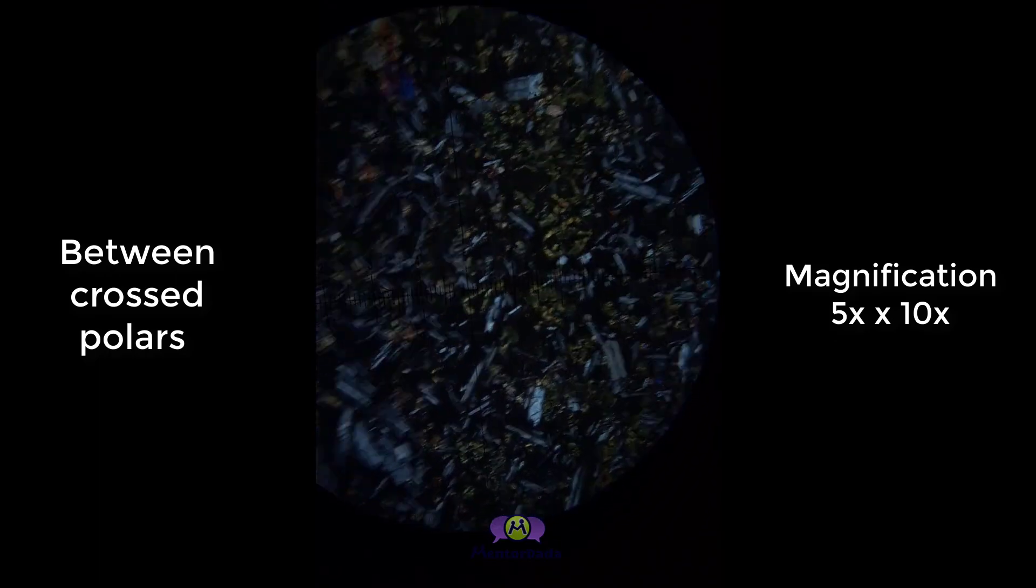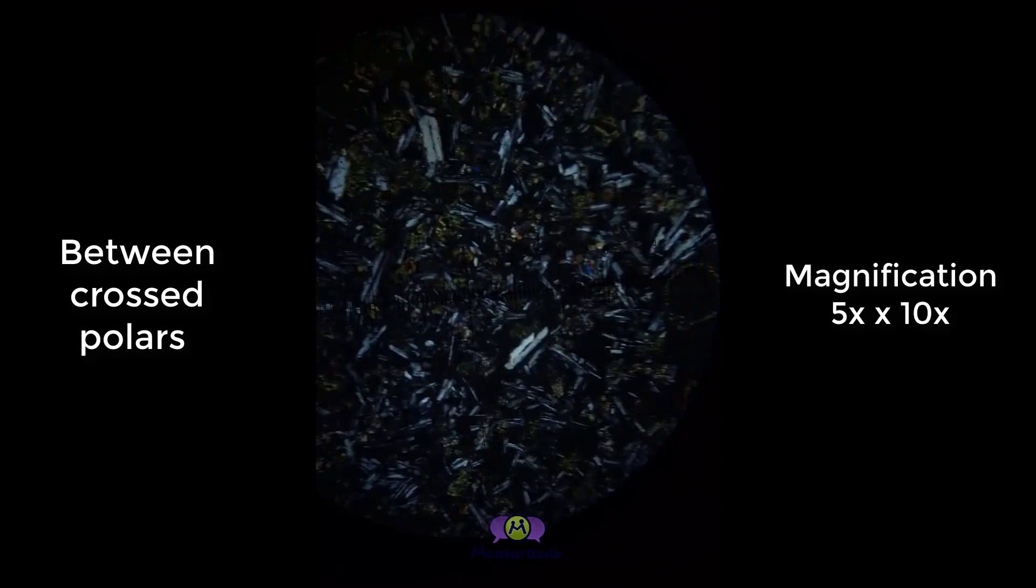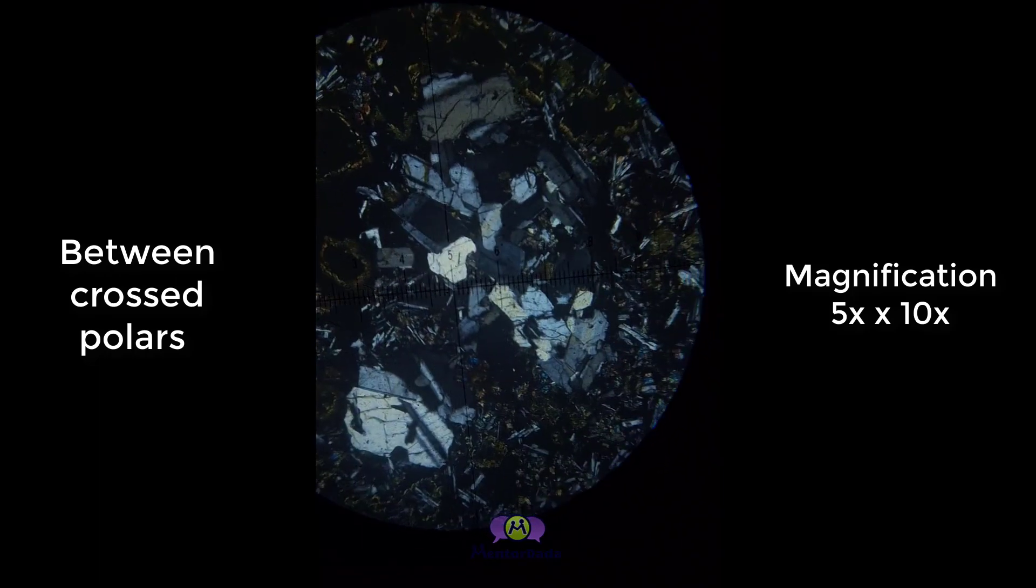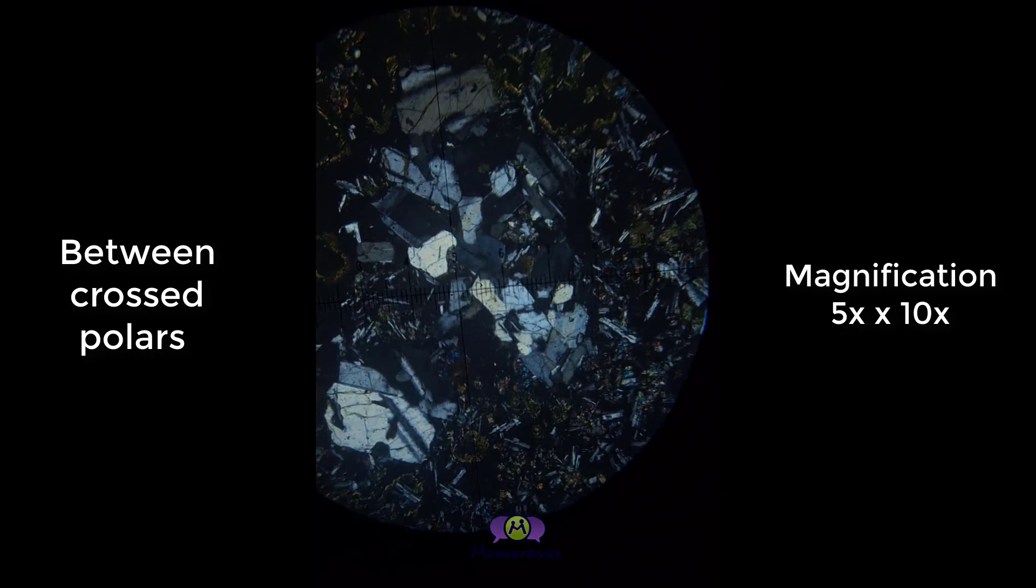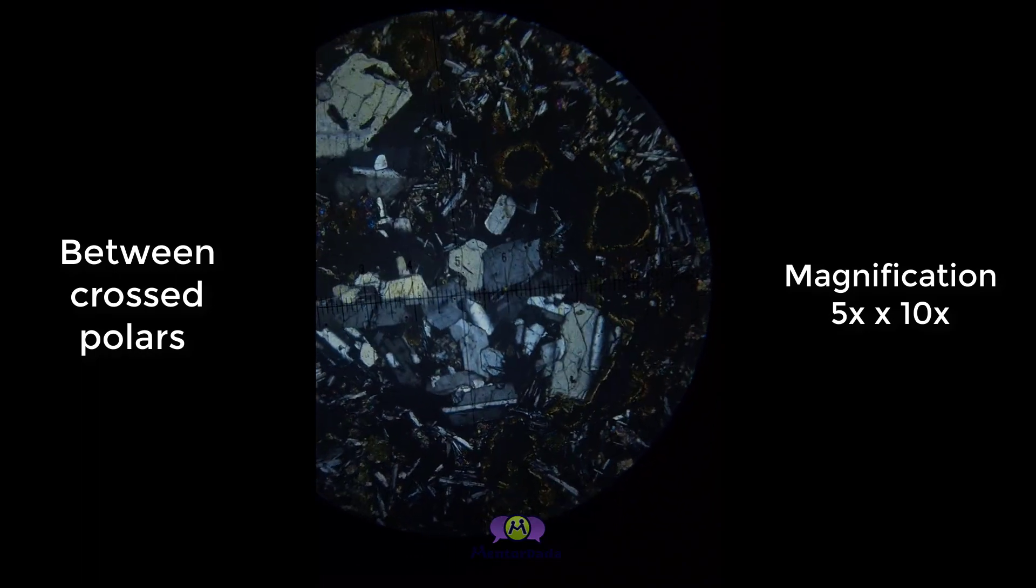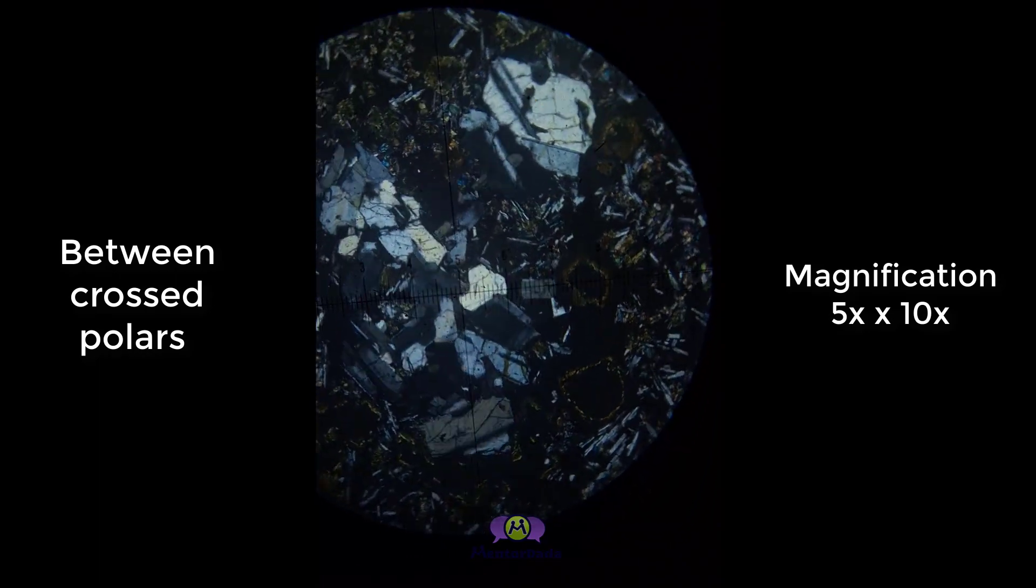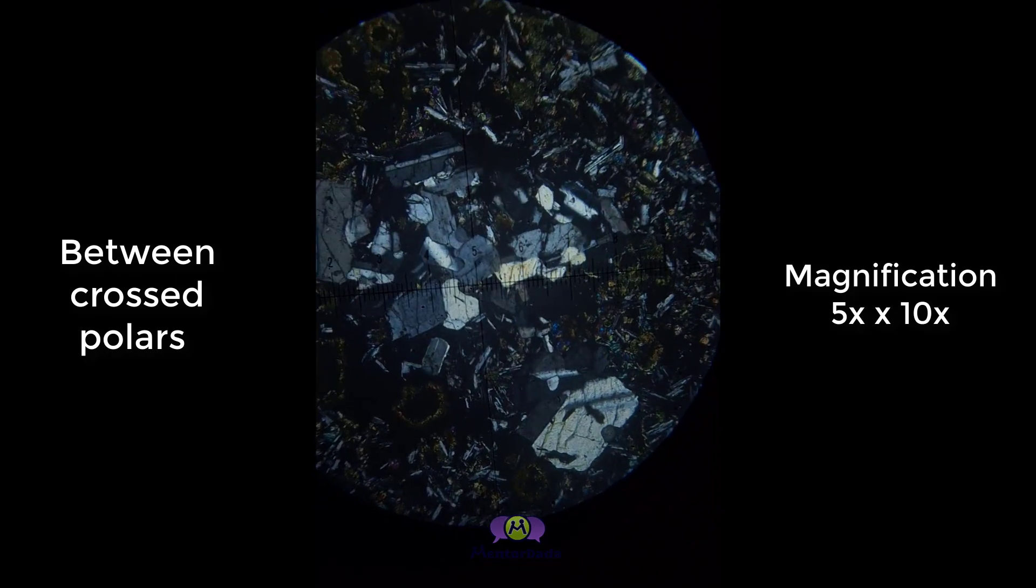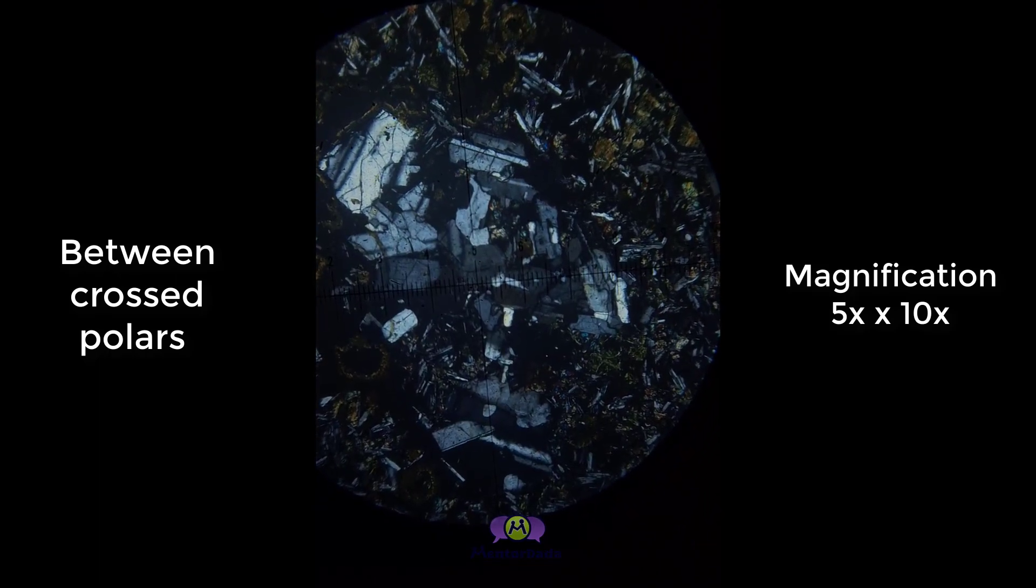At this area you are observing multiple phenocrysts of plagioclase clustering together, and we can call this texture a glomeroporphyritic texture.